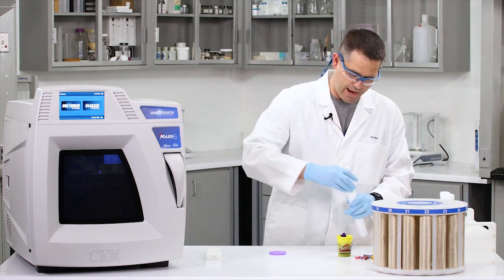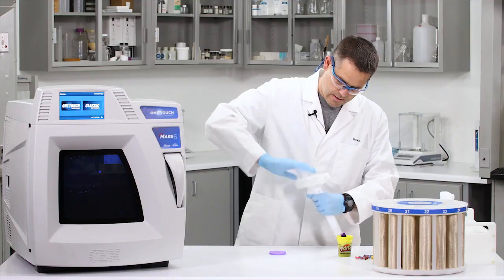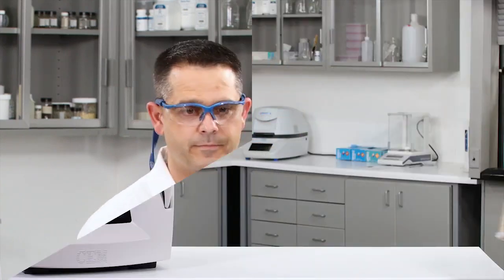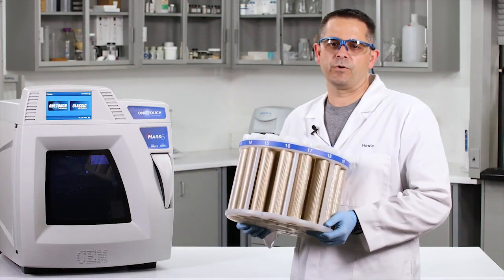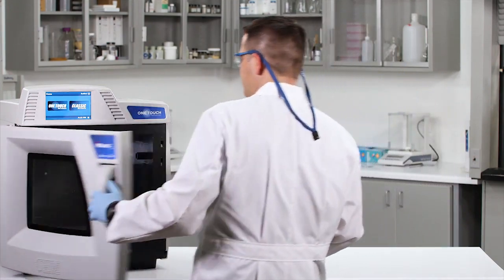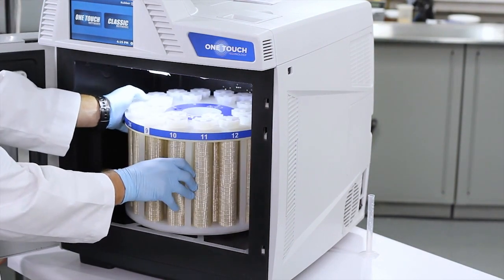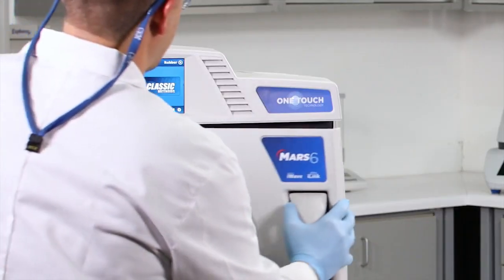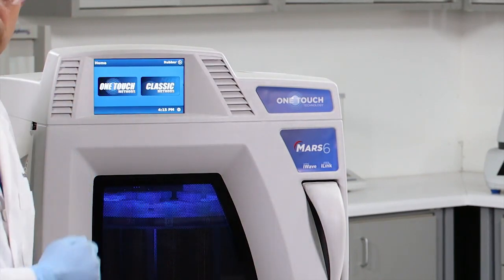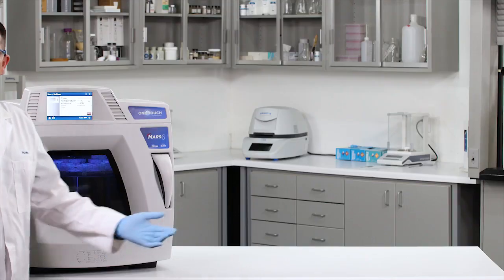And we are going to cap it and torque it down. And now that we've got these done, it's time to head over to the microwave. And now that all of our samples have been weighed out and acid added, let's go to the microwave. Now that they're loaded, I'm just going to add and select my rubber one-touch method. Press start and let the fun begin.